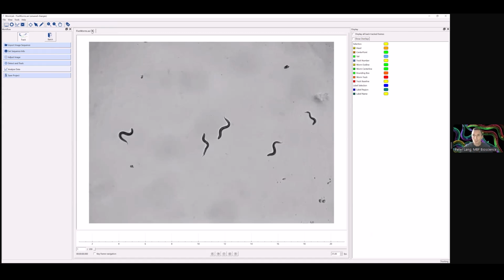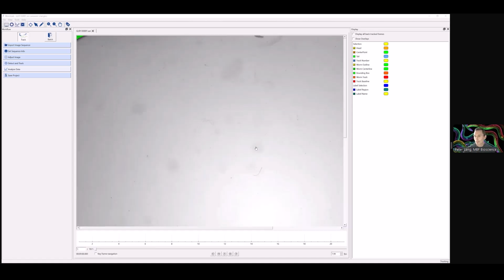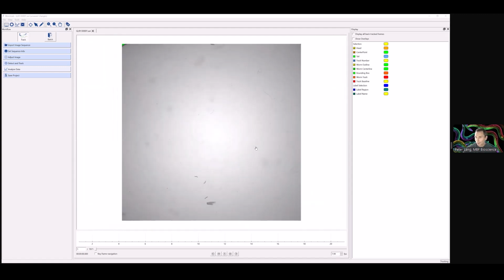All right, so we'll open up a couple of examples here. The first one we'll start out with, I'll load in a video and I'll zoom out a little bit.